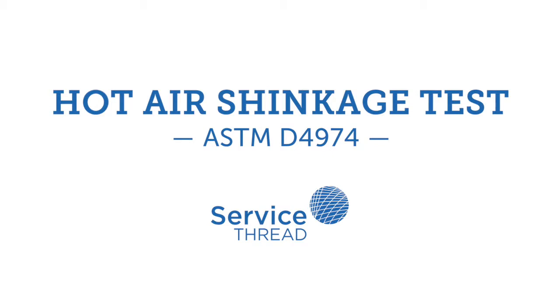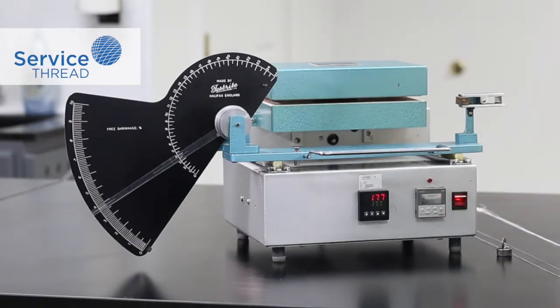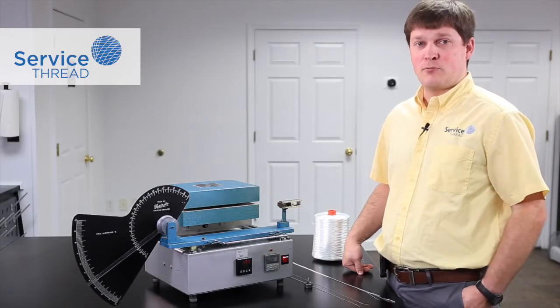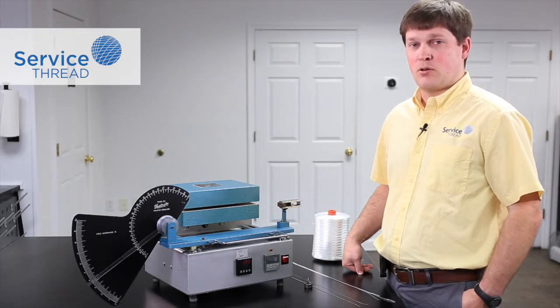Here we're going to demonstrate ASTM D4974, the hot air shrinkage test. The shrinkage test is performed at a temperature of 177 degrees Celsius for two minutes, and we use a pretension weight of 0.05 grams per denier. For this example, we're going to use a 1000 denier low shrink material, so that means I need a 50 gram weight to apply as pretension.